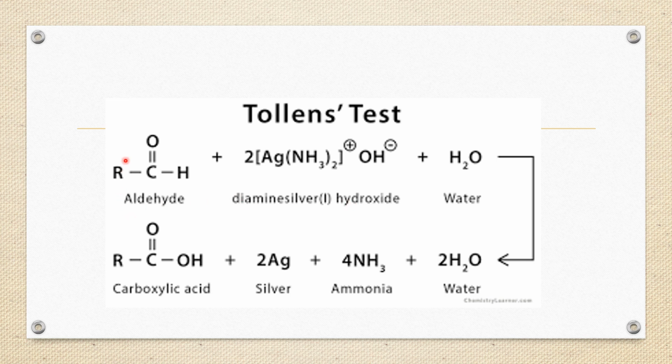When we add the sugar sample containing the aldehyde group, this strong reagent will oxidize the aldehyde group into a carboxylic acid.